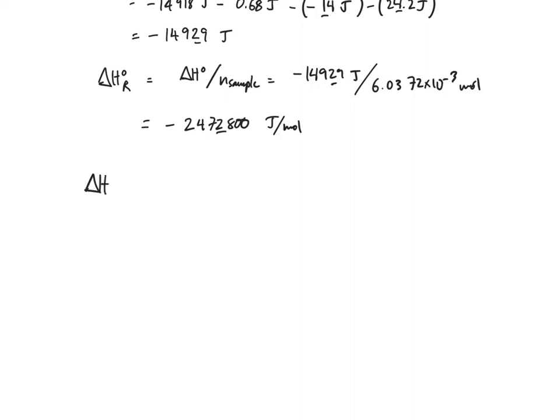Now the final step for this whole procedure is to get the heat of formation for biphenyl. And if you look in your protocol, it's one of the first equations.